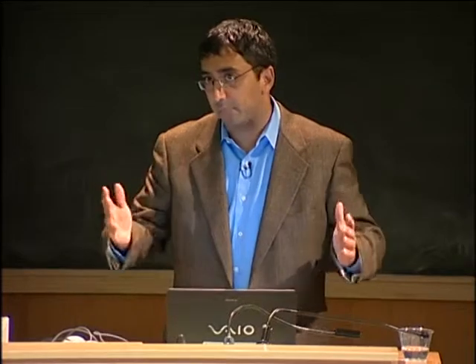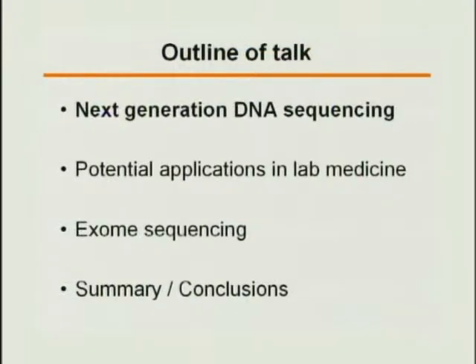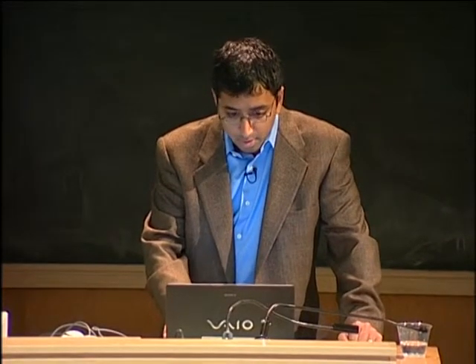I know there's probably a pretty diverse set of backgrounds here, so I'm going to start with a pretty broad introduction to next-generation sequencing, assuming you know nothing about it. And I'll go on to discuss some potential applications in lab medicine. And I'm going to come back to some work that is ongoing in my own lab and other labs in genome sciences with some potential relevance. And I'll then just try to summarize and wrap up.